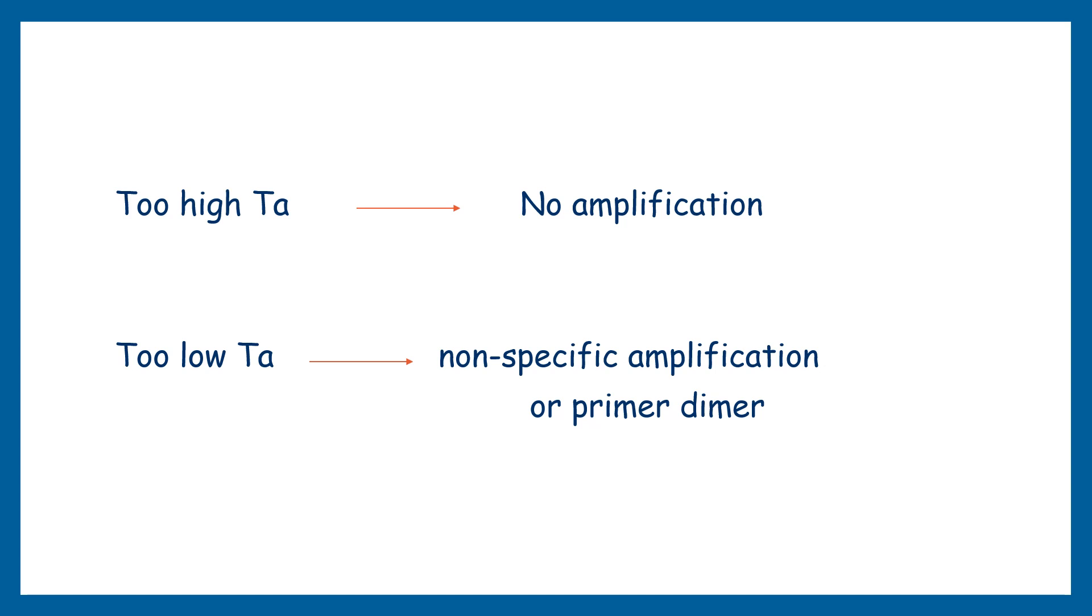When we talk about too low annealing temperature, we may get non-specific amplification or primer dimer because lowering the annealing temperature in PCR can provide flexibility to primers which allow them to bind to different positions in the DNA sequence, therefore it leads to non-specific amplification.